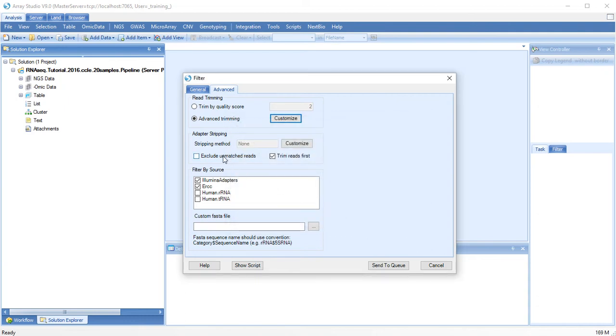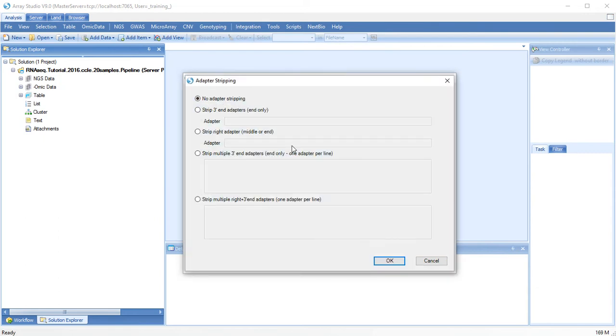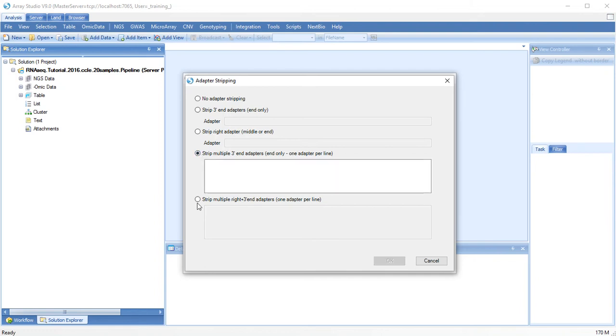Array Studio can also search for adapter contamination and strip the ends of reads to remove these sequences. You can either strip only from the very 3' end of the read or from the middle of the read, and you can also search for multiple adapter sequences.